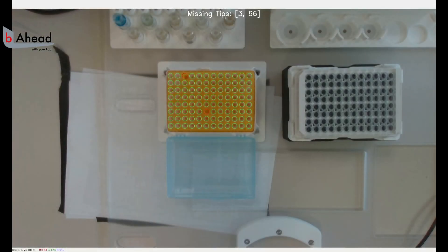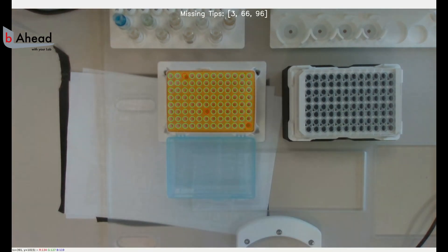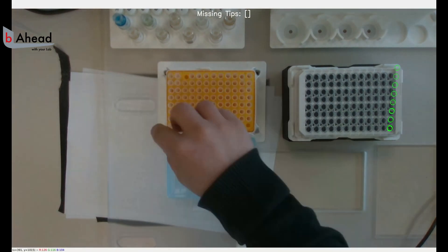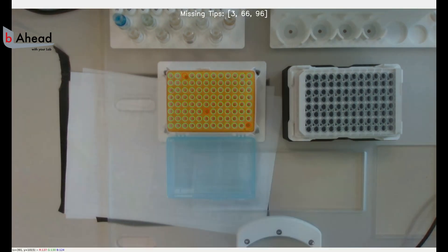To check for missing tips inside the tip rack, another neural network was trained to visually detect the center position of the four corner tips. The other positions are then interpolated based on these detections.